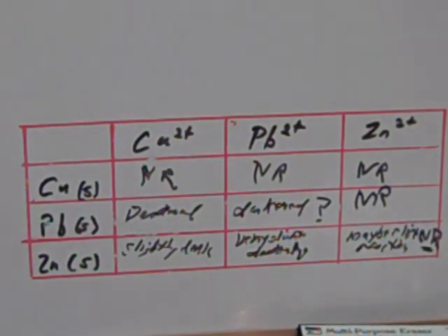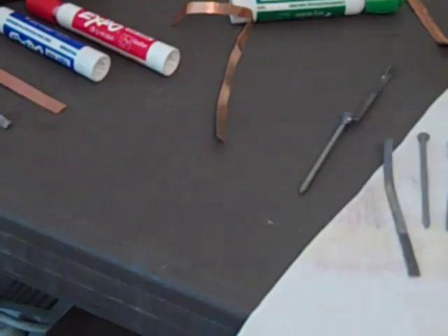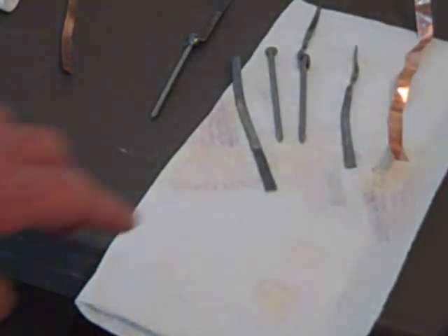But you can report these results. We're actually supposed to have no reaction here. This is supposed to be no reaction. But we had a reaction. And here it is. You can see it right there on the edge, the darkened lead down the bottom.